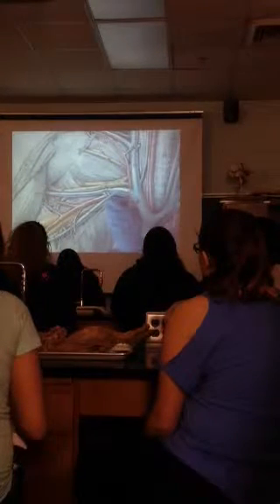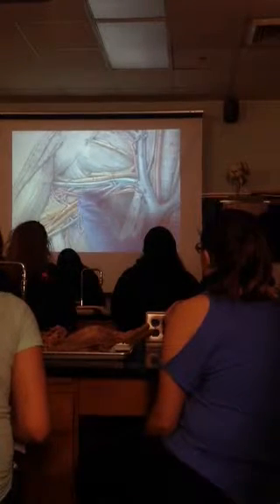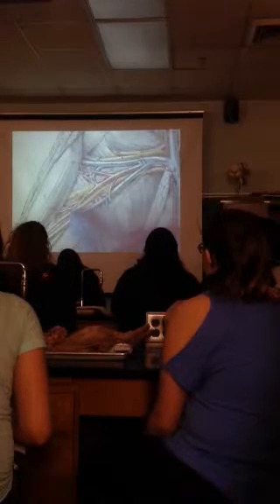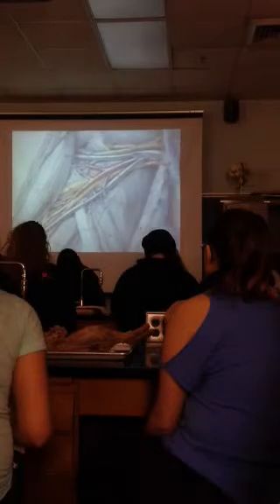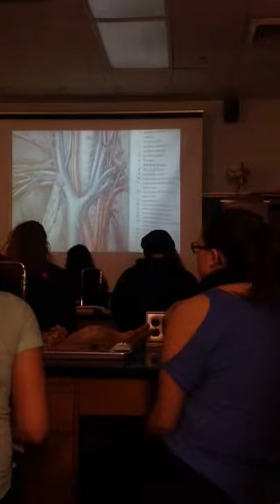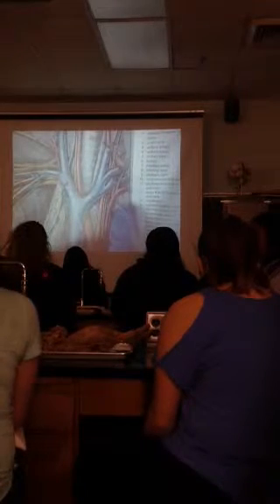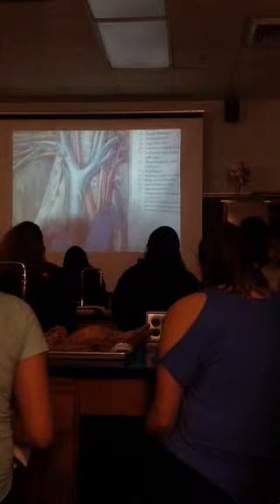Then it turns into axillary, armpit region. Once we pass subscapular artery, name change, we go into brachial. And it's brachial all the way down to the elbow about, and then you're going to have deep brachial coming off of that for arteries. So this is all blood going away. Okay, so on this left side, you're going straight up to left common carotid, and then left subclavian.